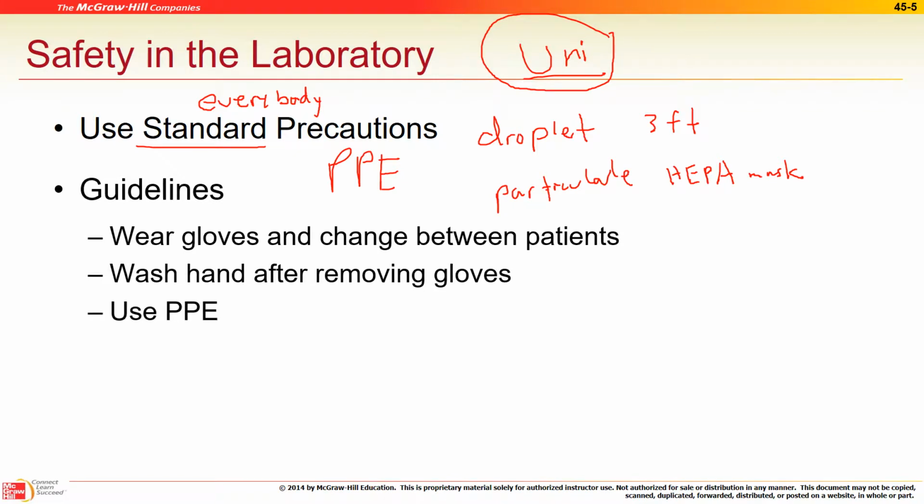Of course, wash your hands in between patients. Take your PPE off before you leave the room. Avoid sharp injuries. One thing we don't do is recap needles.